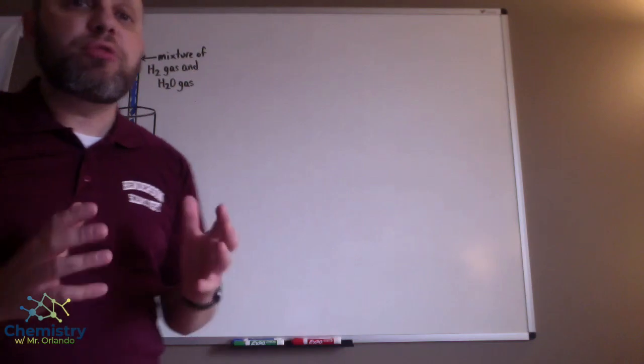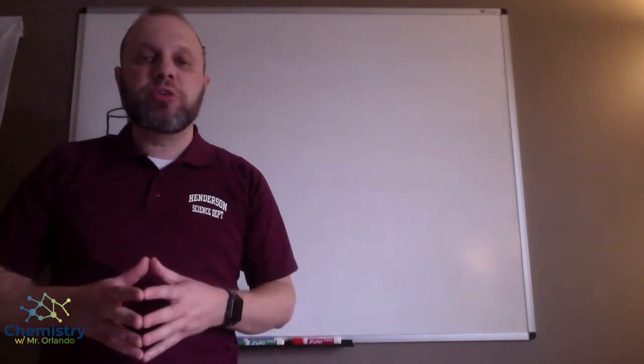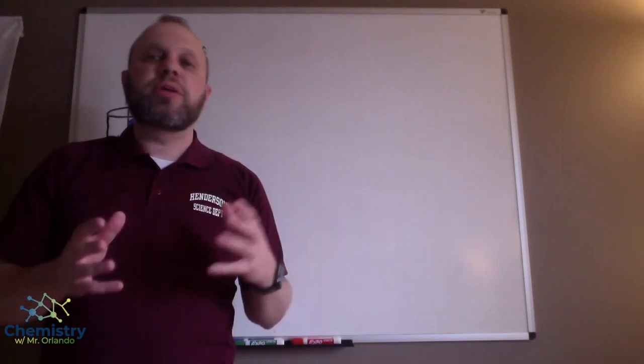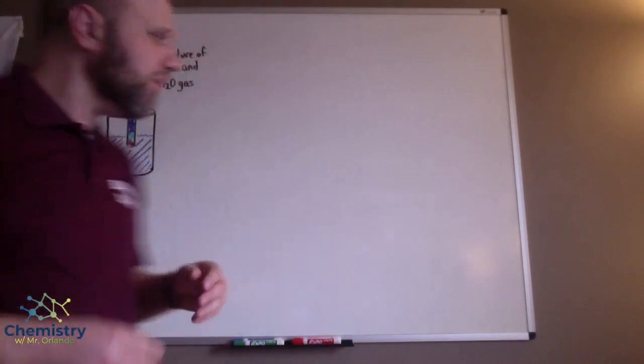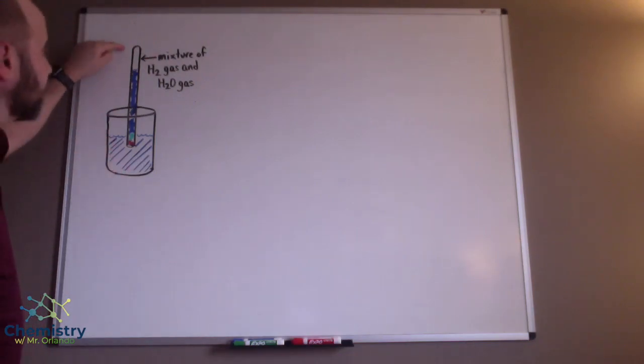Now, hopefully you've watched the video on molar volume of a gas lab that I included in the folder. That actually does a really good job at a slow pace of going through exactly what you're doing to set up the lab, and it explains how the hydrogen gas is collected. So what I wanted to do is to show you just a quick recap of that.